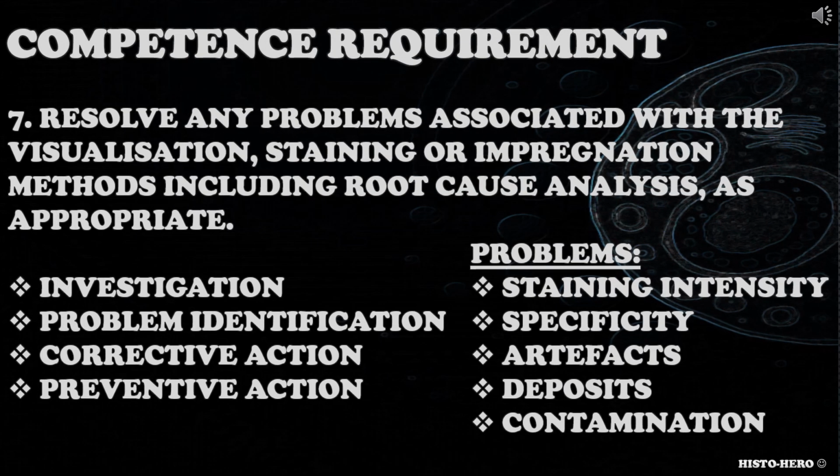The seventh competence requirement is for you to resolve any problems associated with the visualization, staining, or impregnation methods including root cause analysis, as appropriate. What are the common problems associated with demonstration methods for infective agents? How would you resolve them? How would you record them? Consider investigation, problem identification, corrective actions to fix the issue, preventive actions to minimize problems from reoccurring.